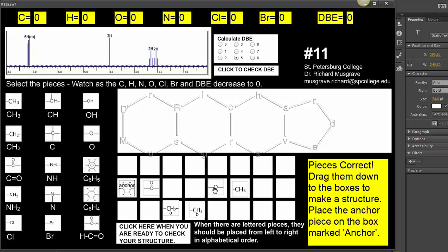So really all we're left with is this kind of situation where the CH2 groups are connected to the aromatic ring and the C double bond O and the O are here, but we recognize of course that the C double bond O and the O could be in either this order or in this order, and we have to figure out which one it is.